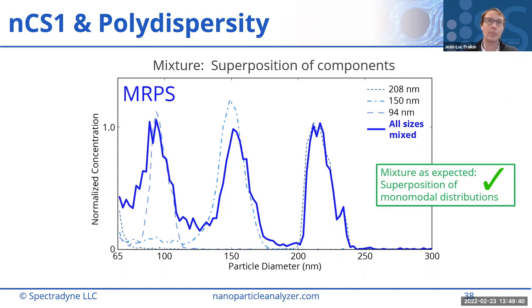But most of our customers are really only interested in a certain sub-range of that. Depending on their application, they select the size range of interest, so they're doing a single measurement every time. Does that make sense? It does, yes.